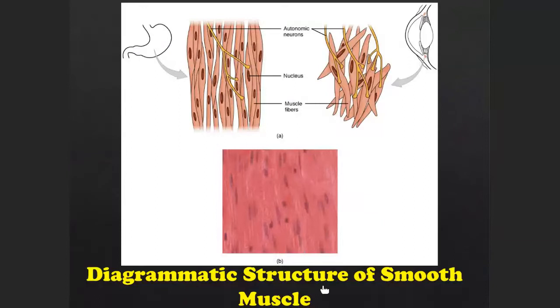Now this is your smooth muscle. Now as we have discussed, in the smooth muscles the fibers are arranged in irregular fascicles. So these are fibers. See their arrangement. They are arranged in irregular fascicles. They are shortened and elongated. See the nucleus. Okay.